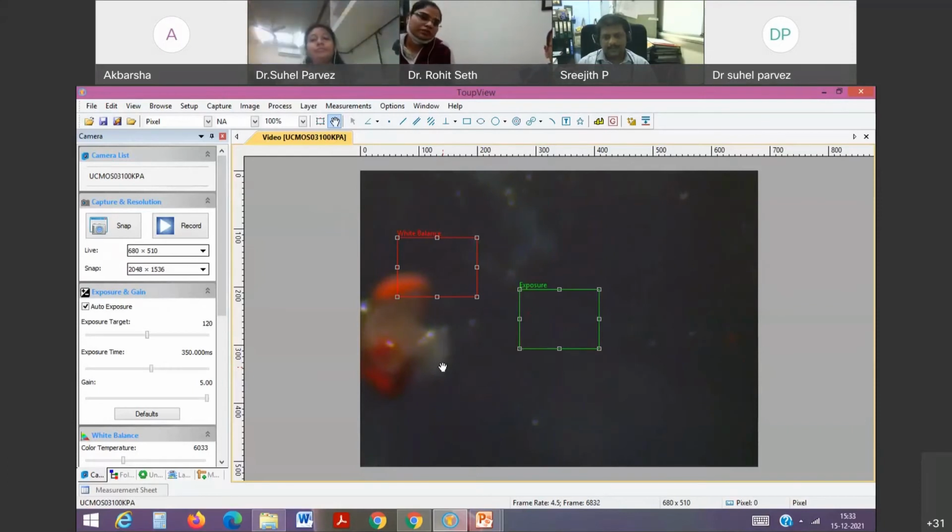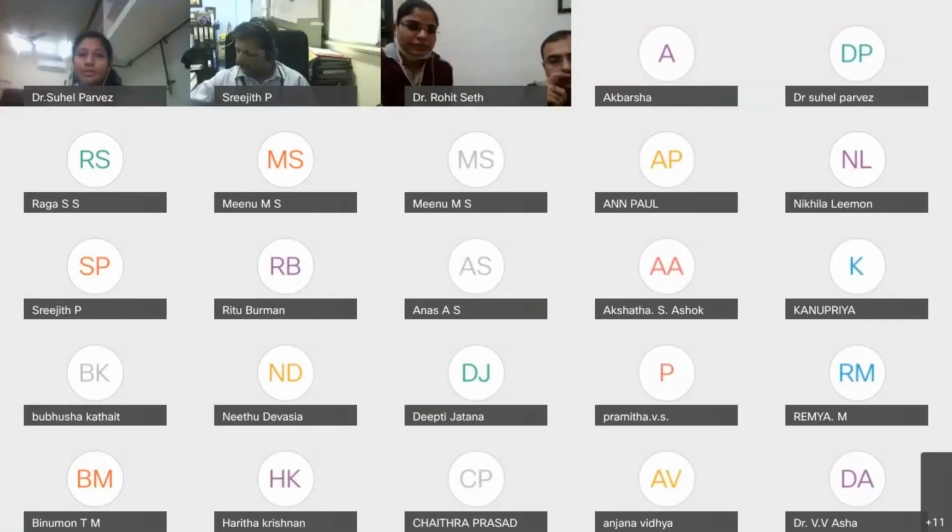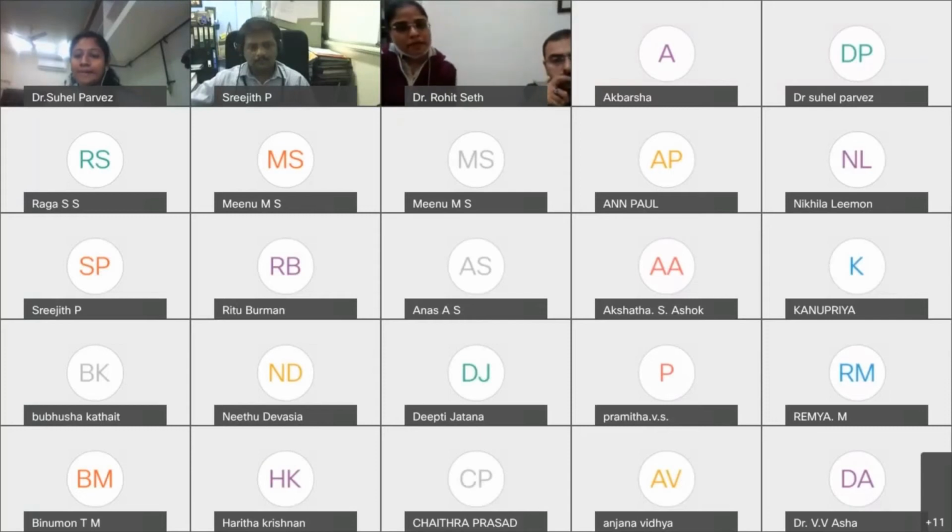And the culture medium, how are you preparing it? Okay, I want to show you. The culture medium contains mixed flour, agar for solidification of the food, sucrose and yeast. How much percentage are you taking? It is a standardized recipe for Drosophila food medium, which has already been used. This is visible on the other screen, I think. The food content.